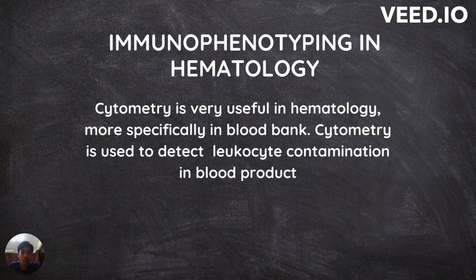Next is immunophenotyping in hematology. Hematology is the study of blood and blood diseases. So cytometry can be used in hematology, more specifically in blood banks, usually to detect leukocyte contamination in blood products.